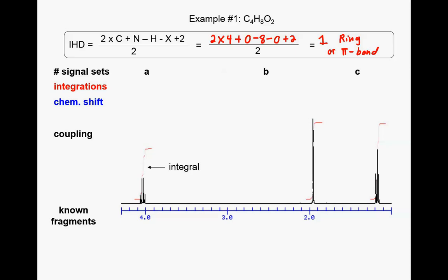All right, so I see one signal here. Now that signal, we don't just see one peak, but what accounts for the fact that we see multiple peaks for one structure here? It's splitting, right? So we have one peak here, and another peak here and another peak here. And so this red line here is done after the fact. So we obtain our spectrum, and it comes into the computer, it just sees the black peaks. And so then we ask our computer to go ahead and integrate these peaks.